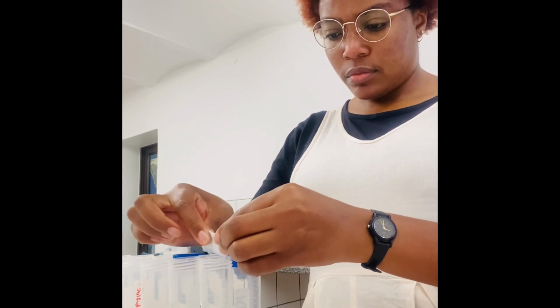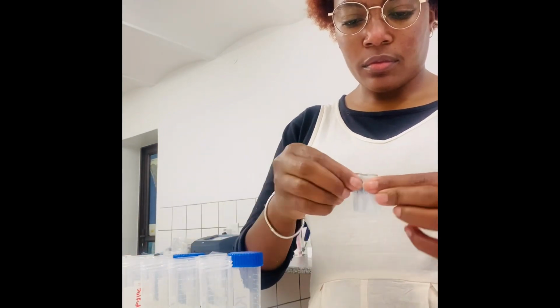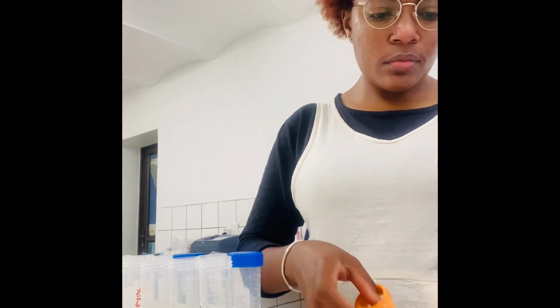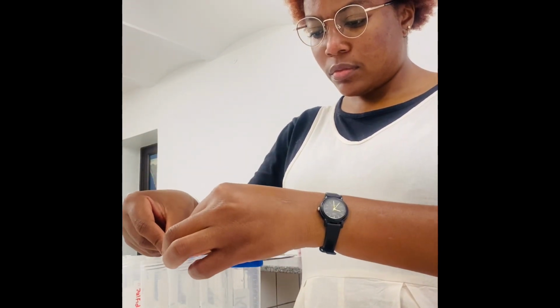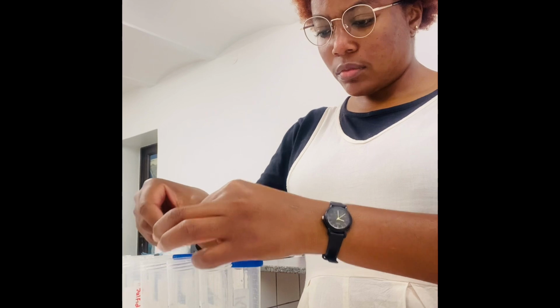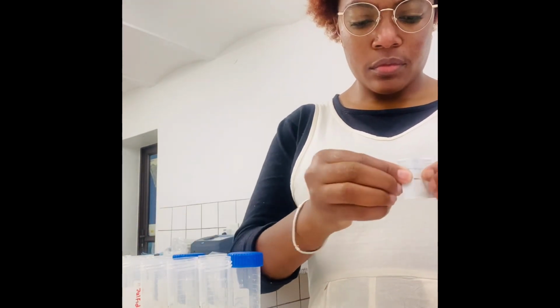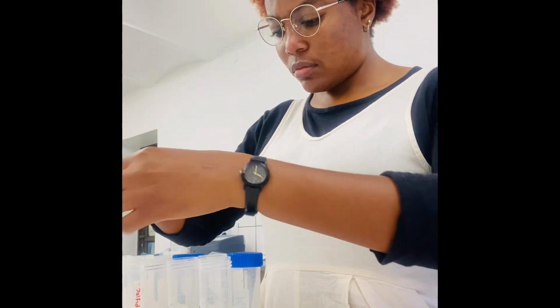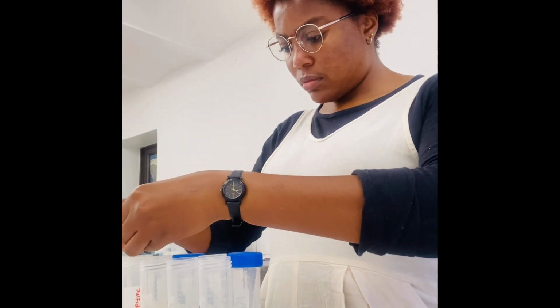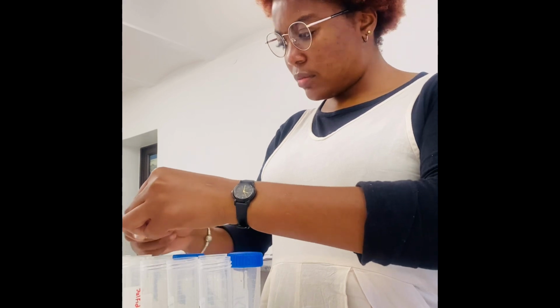So what happens is we collect water on a daily basis from the ocean, from a certain sampling point that we have, and we bring the samples to the lab, and then we start with the nutrient analysis. As you can see in the video, I use powder pillows, which are my reagents to analyze for these nutrients.